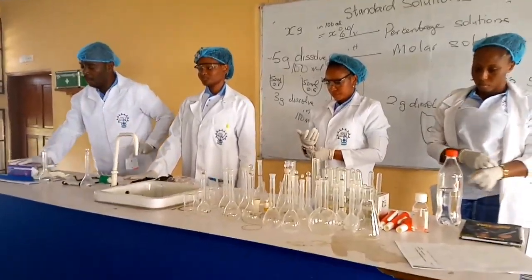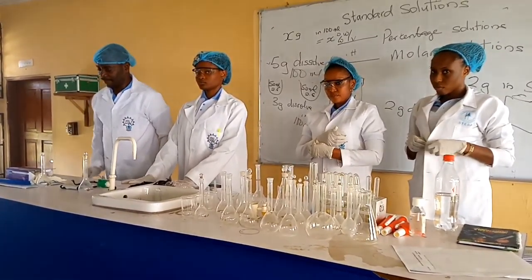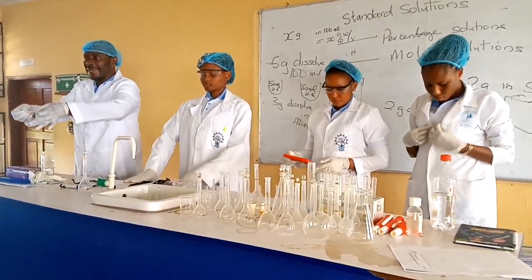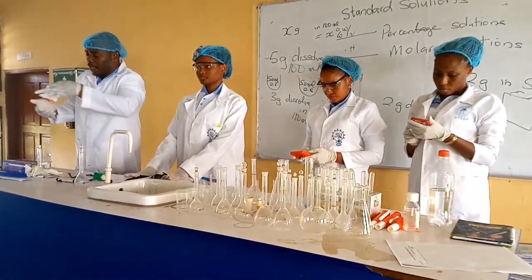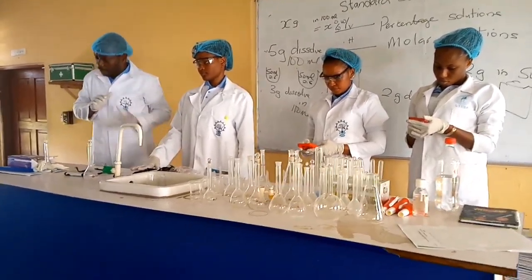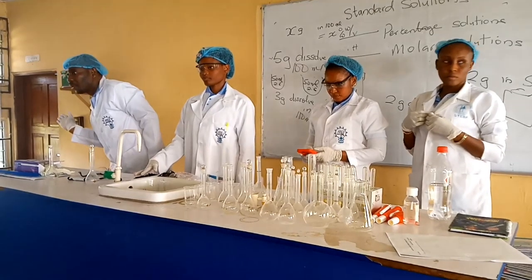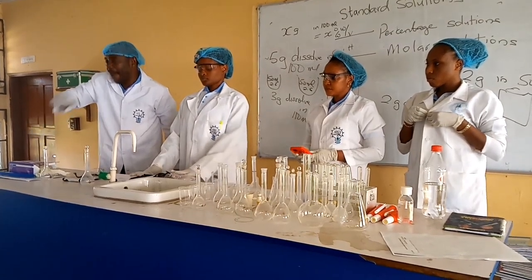Now once you stand there, there are different kinds of weighing balances. Once you get there, you turn it on. It comes on and gives you what? 0.00. Nothing is on it. You now carry your weighing pan or this nylon here, or it might be a weighing paper. You put it on that weighing balance. It will reflect that you have put something. There are some kinds of weighing balance that have a button you press. Tap. It will go back to 0.00. It will erase the weight of this paper or nylon.